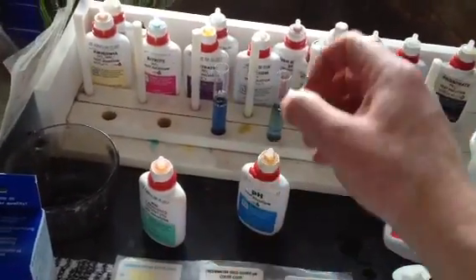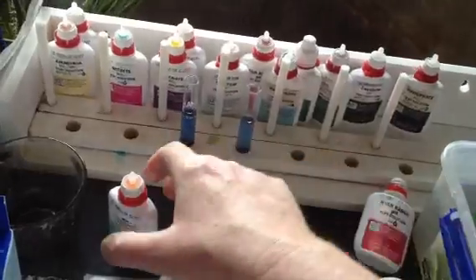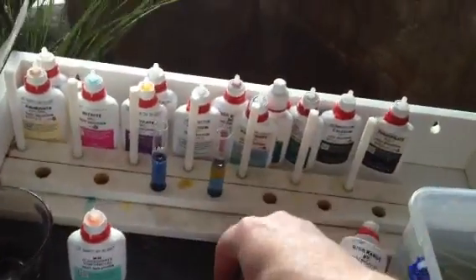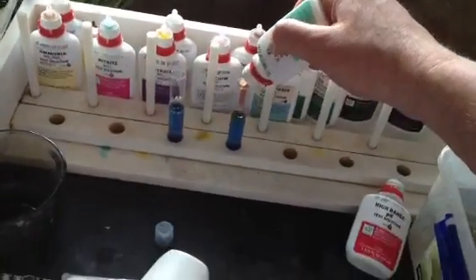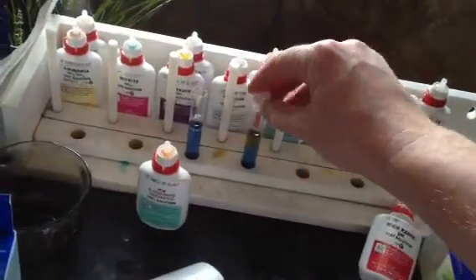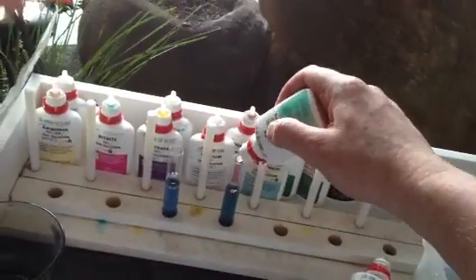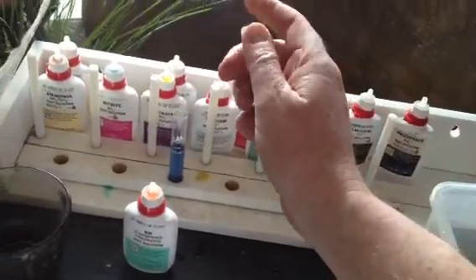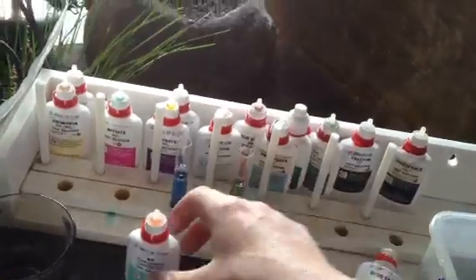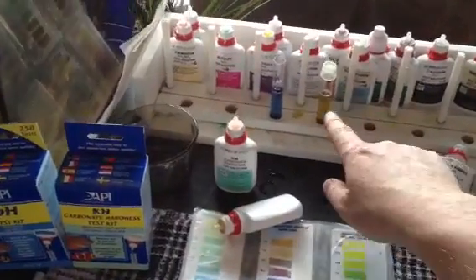Then you go one drop and shake it, then another drop — two, three, four drops — shake it, still blue. Five, six, seven, eight drops, still blue. Nine drops — and see how it started to change: it was blue, now it's gone to a green color. And then ten drops, not including the first drop, now it's yellow. So you're basically counting the drops between when it starts off blue and turns to yellow.